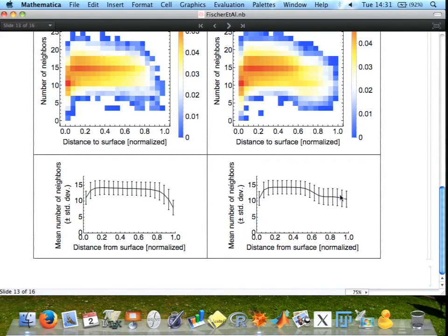So essentially we now have a pipeline where we can put in all these data sets. So our colleagues, the biologists, will then produce, I don't know, 10, 20 spheroids. We put them into the pipeline, and then we get these graphs out. And we can then, of course, do that same thing with spheroids that were treated with drugs. So then we can find differences in the cell packing and see what effects certain drugs have.